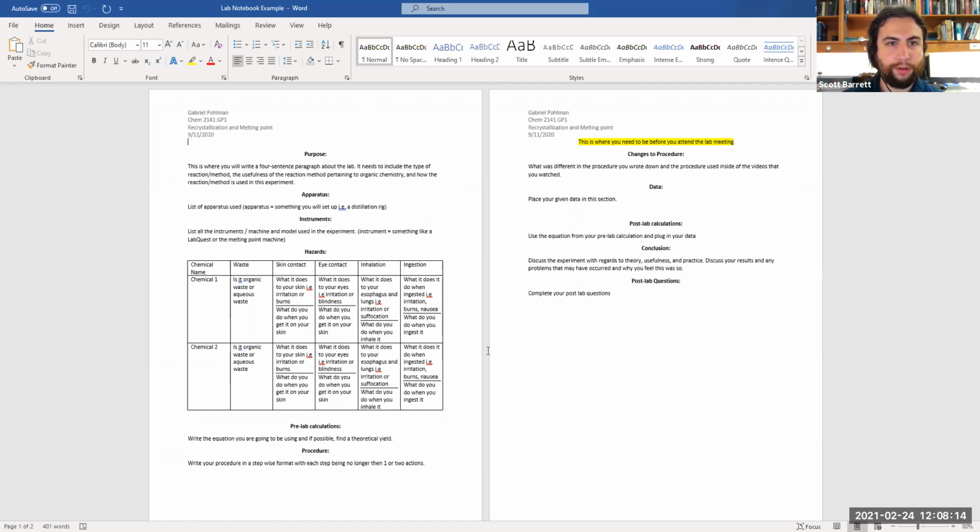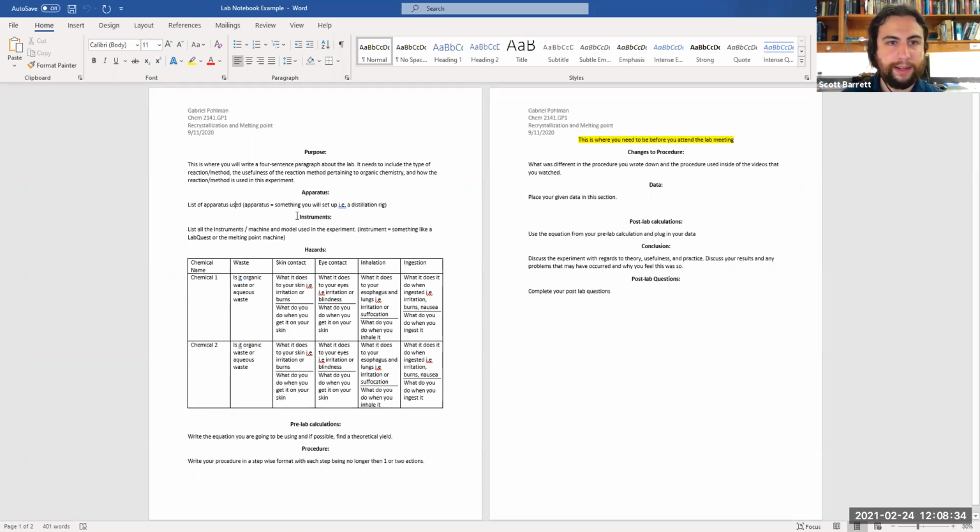Just make sure that you know the differences between these two, because I saw most people got these two mixed up, or they just listed the vacuum filtration as an apparatus, but that is an active performance that you do within a lab. It isn't a tool itself. You would want to list out every single portion of apparatus that is there.